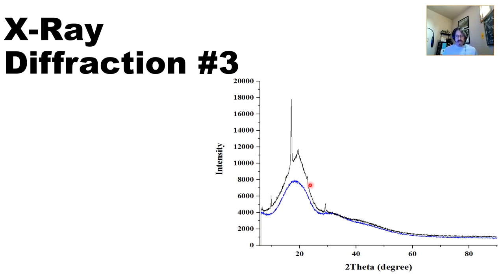So this black line exhibits a level of crystallinity. We've processed the material in this black line differently, so we imparted a degree of crystallinity to our polymeric specimen. We can interpret that by X-ray diffractometry, by looking at these peaks, and where they lie tells us some things as well. We'll get further and further into this in the next two lectures.